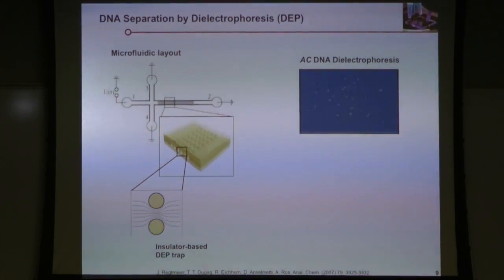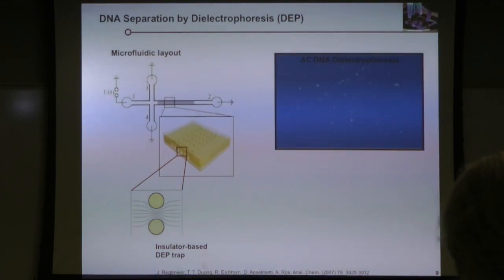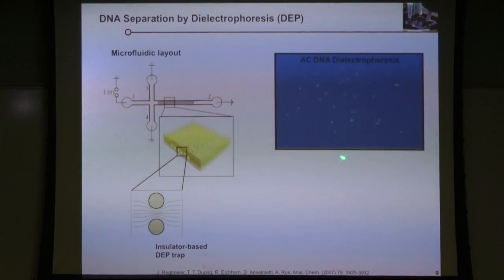And actually that's what is shown here. So now under a low frequency field, we look at a microfluidic channel. The channel is along this axis here, and the light dots you see are DNA molecules that are stained with a fluorophore so that we can observe them with a fluorescence microscope. What I should also say is it's very hard to see: we have rows of posts with tiny gaps, and in between these gaps these electric gradients are created. How long are the DNA molecules? This is lambda DNA, so it's about 48 kilobase pairs, micrometer size. And so you see what happens is these molecules actually get trapped.